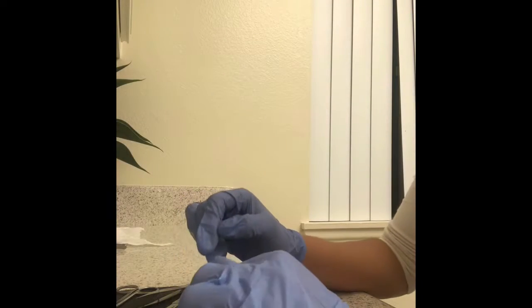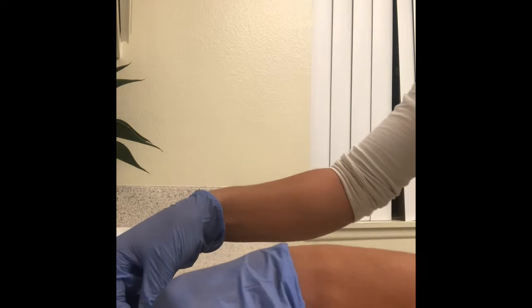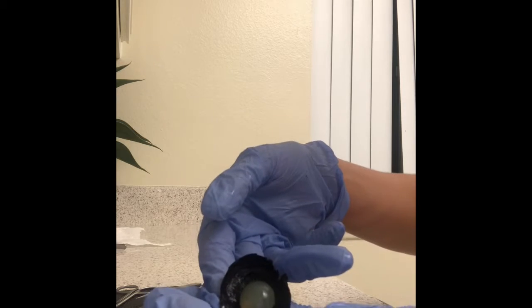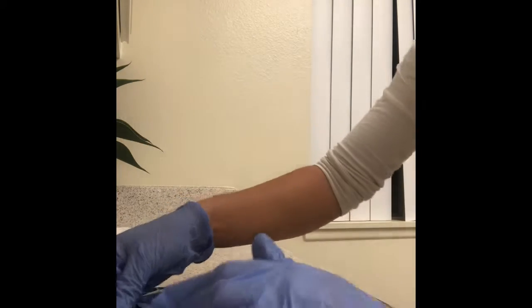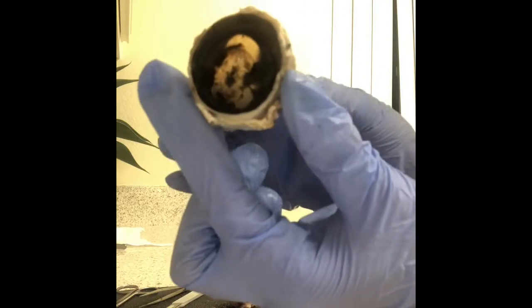Okay, so I've just scooped the iris and the lens out of the eye. So the iris and the lens is going to be right here. That's what it looks like. And then the eye is going to be right there. And you can see right here it's see-through.